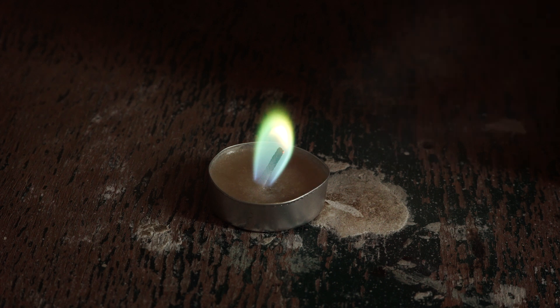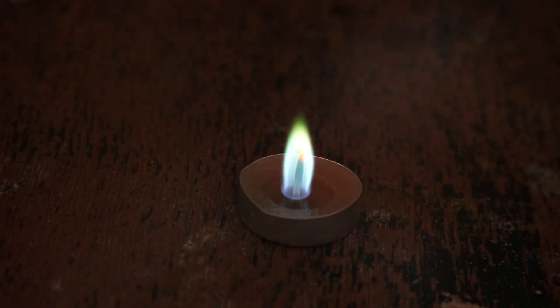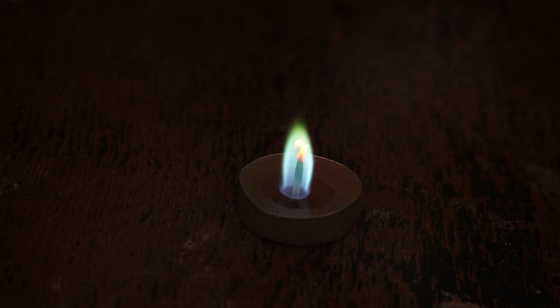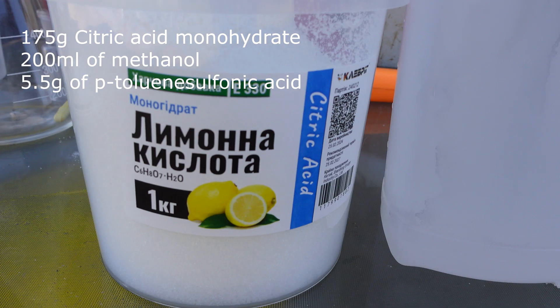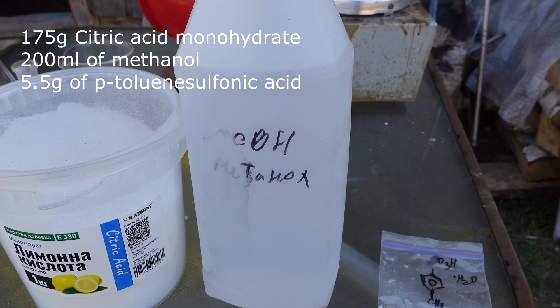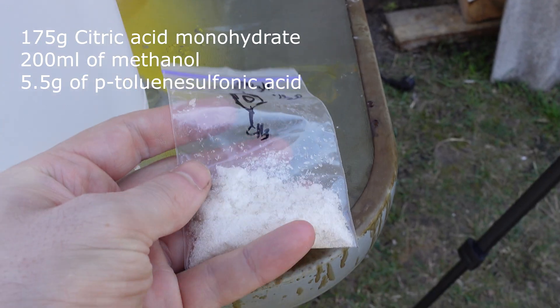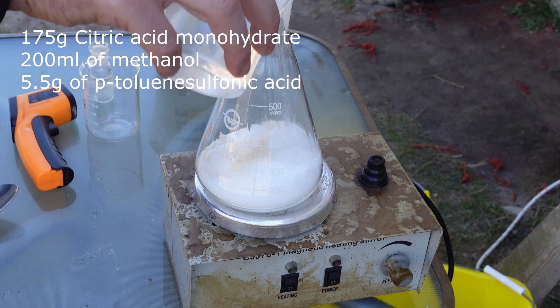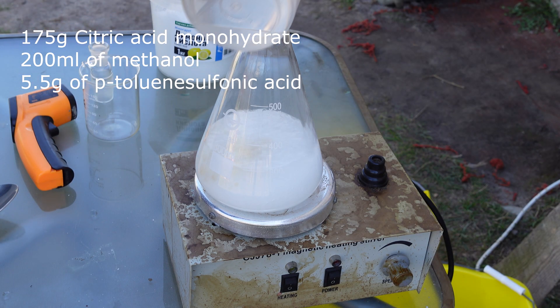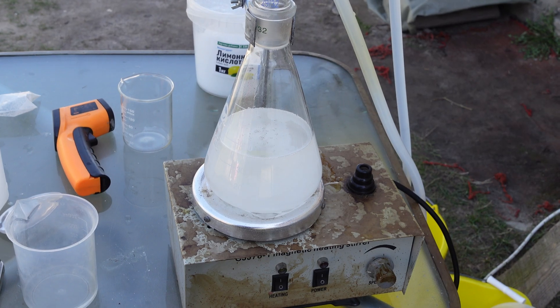So it's time for me to synthesize trimethyl citrate. I put off this synthesis for as long as I could because it's incredibly long and tedious, but eventually I synthesized it. The synthesis itself is quite simple. I took 175 grams of commercially available citric acid, poured in 200 milliliters of methanol, and added 5.5 grams of para-toluenesulfonic acid as a catalyst.